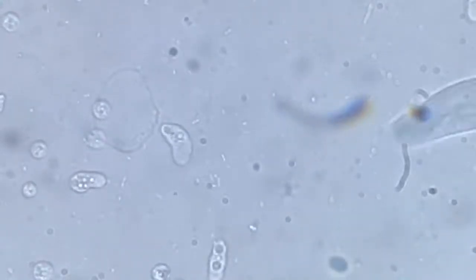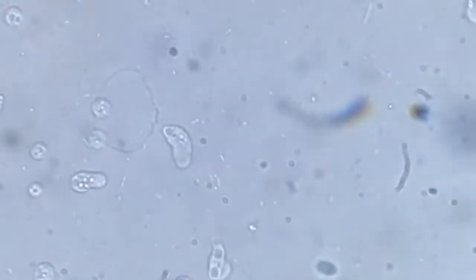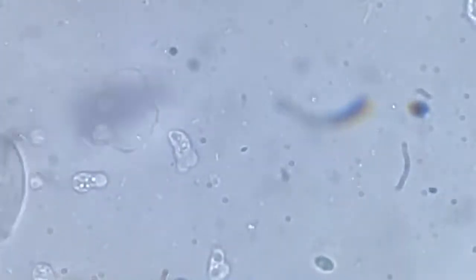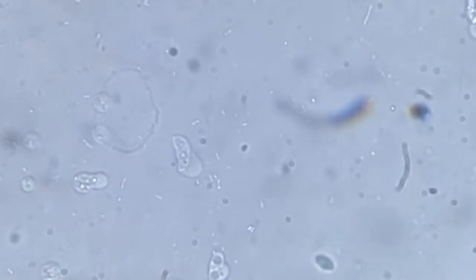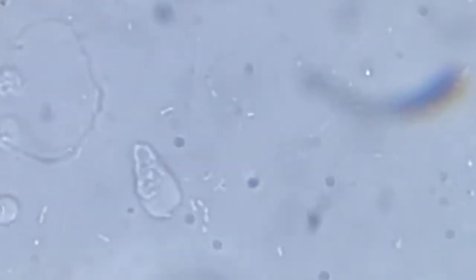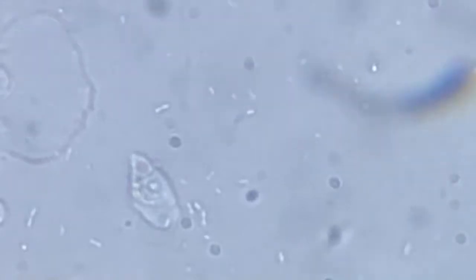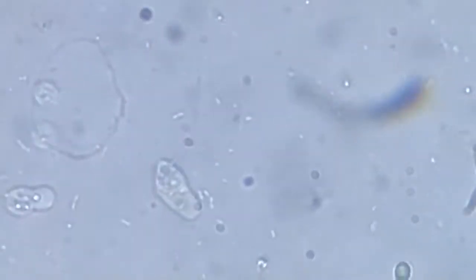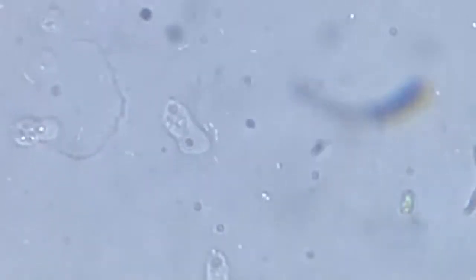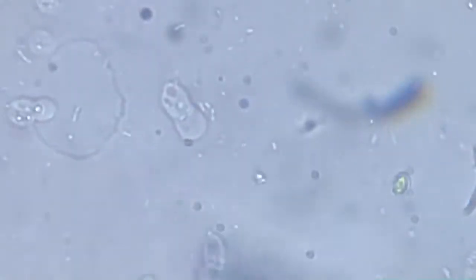Then we have one coming in the center, the bigger one. We'll try to bring him in focus if we can get a clear picture of him. This is digital zoom, so at times it's pretty blurry.